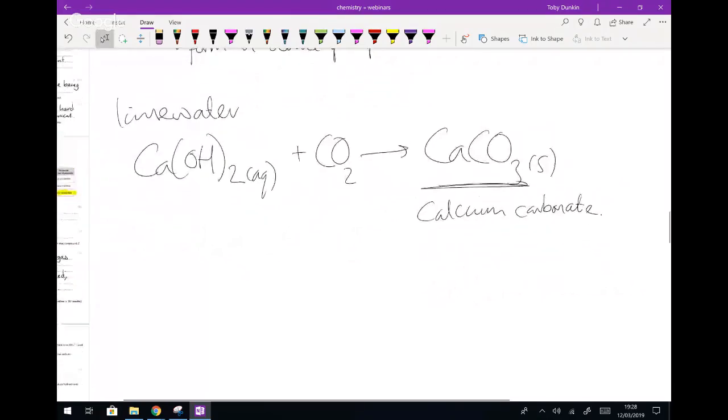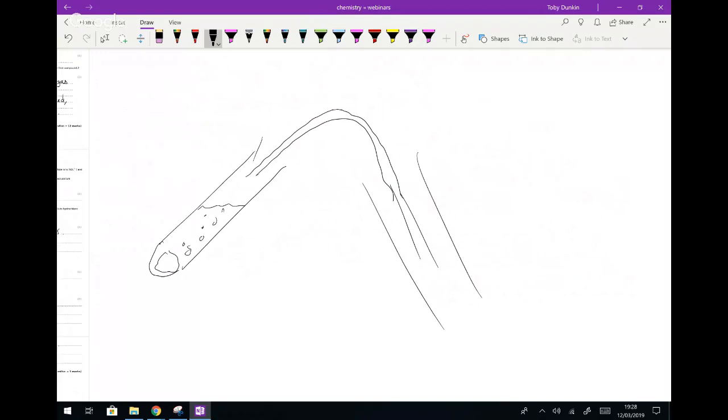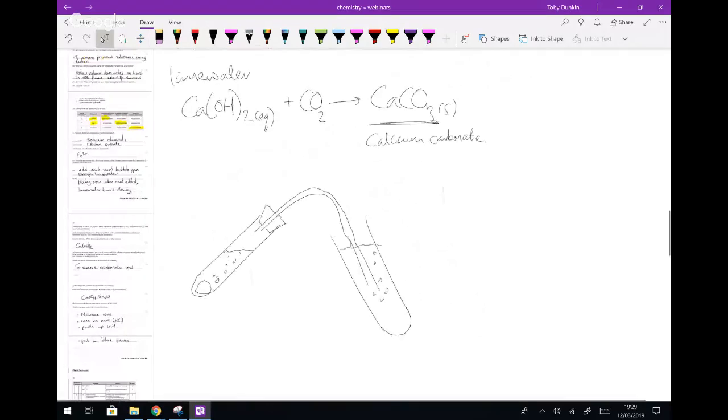So I'm just going to quickly show you guys, and I know you'll probably think it's ridiculous drawing out these, but they do appear, and it's absolutely amazing how often these pictures appear. These are my bubbles, and I'm going to deliver it into a second tube. Try and do this as best I can, not doing that very well. I'm going to bubble that into a second tube, which is full of lime water. And those bubbles I'm going to seal off with a bung. There we go. So the gas is going to go up through the delivery tube, bubble through the lime water, and we're going to see it form a white precipitate of calcium carbonate. And Yana, that equation you do need.